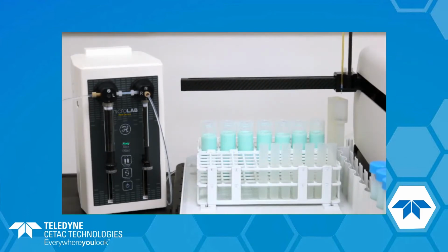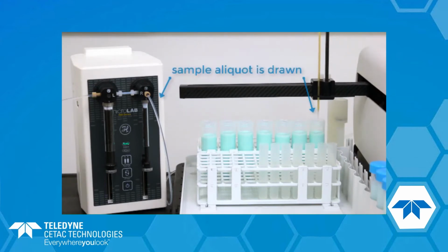So what you can see is we begin with a simple probe rinse. Now that actually primes the lines. This makes sure that everything, all the diluent, is fresh before you begin your analysis. If anything was left over from the last time the system was used, we get that washed out before we begin. Here the sample aliquot is pulled up and then the diluent is drawn.